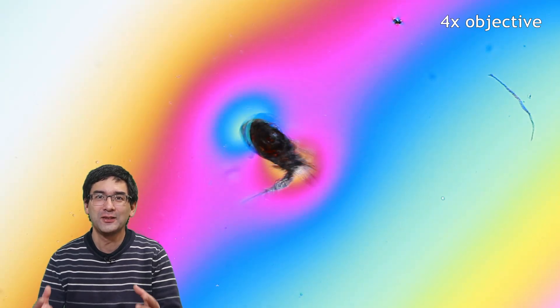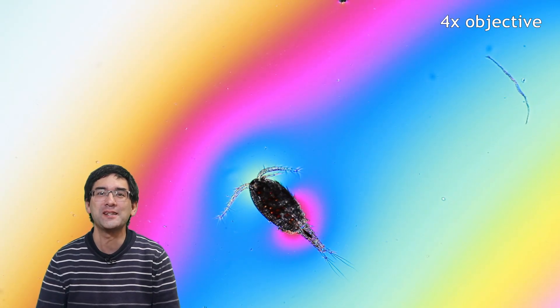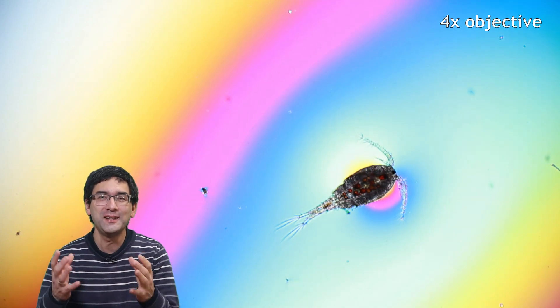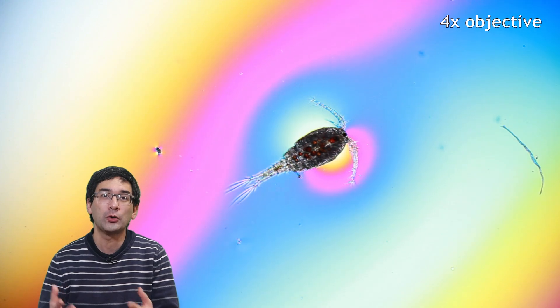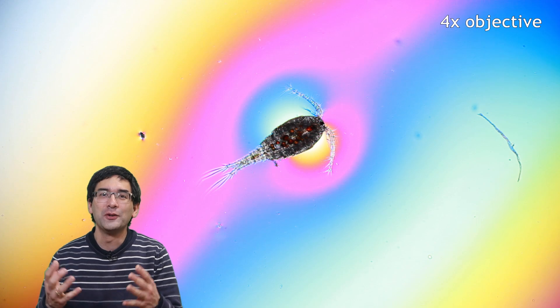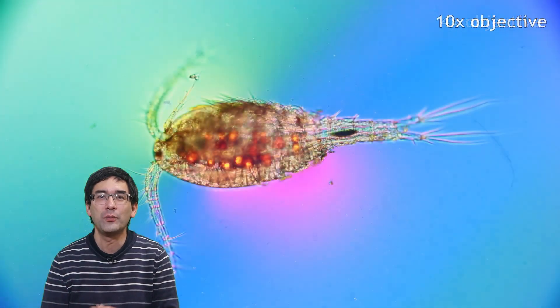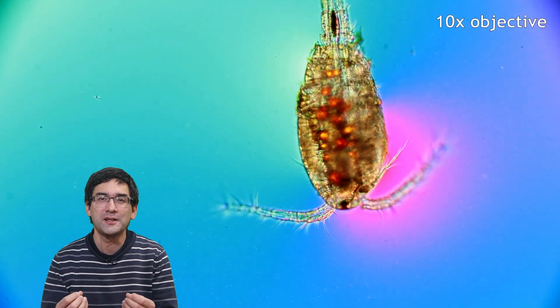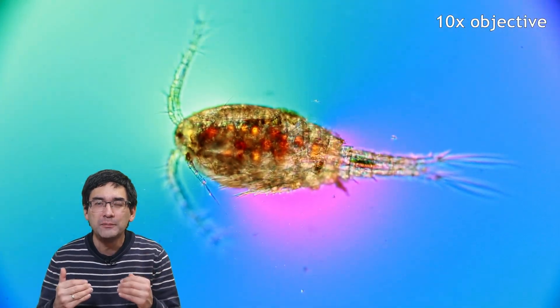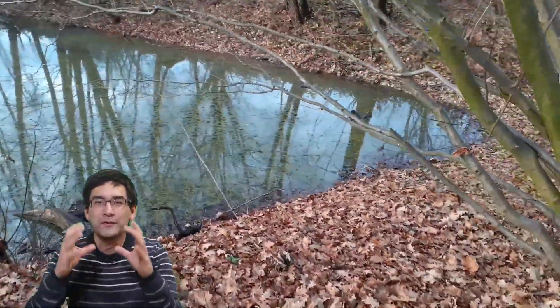Hi, Microbe Hunter here. This little critter is called Cyclops. It is a freshwater crustacean, so it is related to crabs. It's around a millimeter in size. In this video I'd like to show you how I caught it and how I put it under the microscope so that you're able to do the same thing. These freshwater crustaceans move around quite quickly — they snap back their antennae and legs, which propels them forward very quickly, making them a little difficult to observe under the microscope as they move out of the field of view.